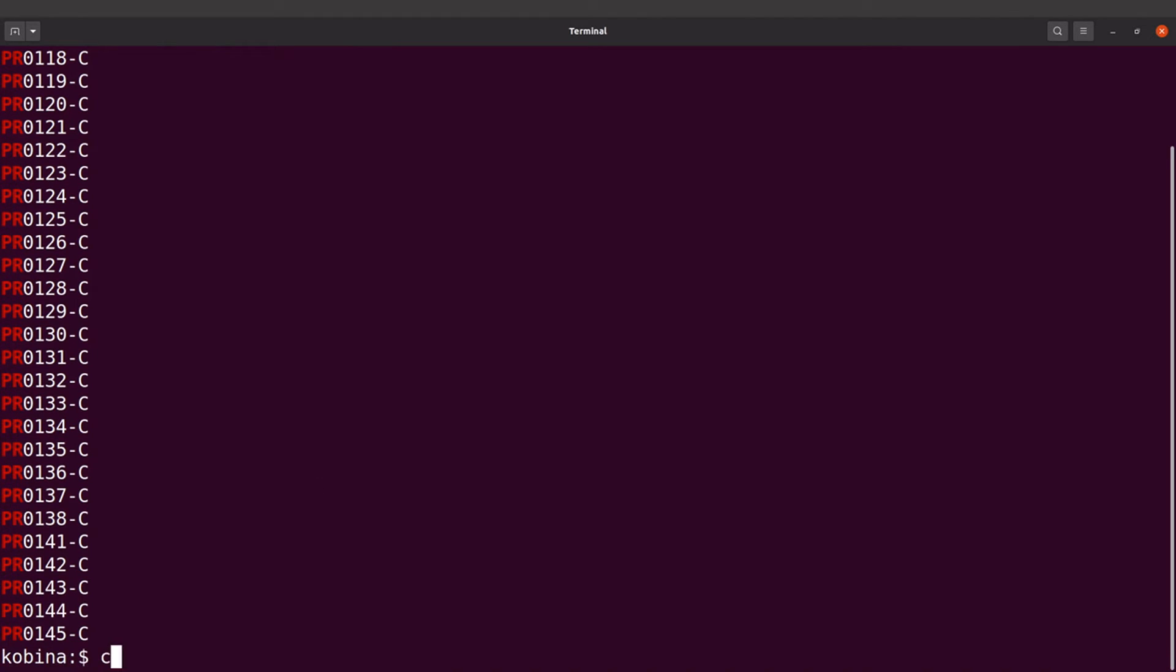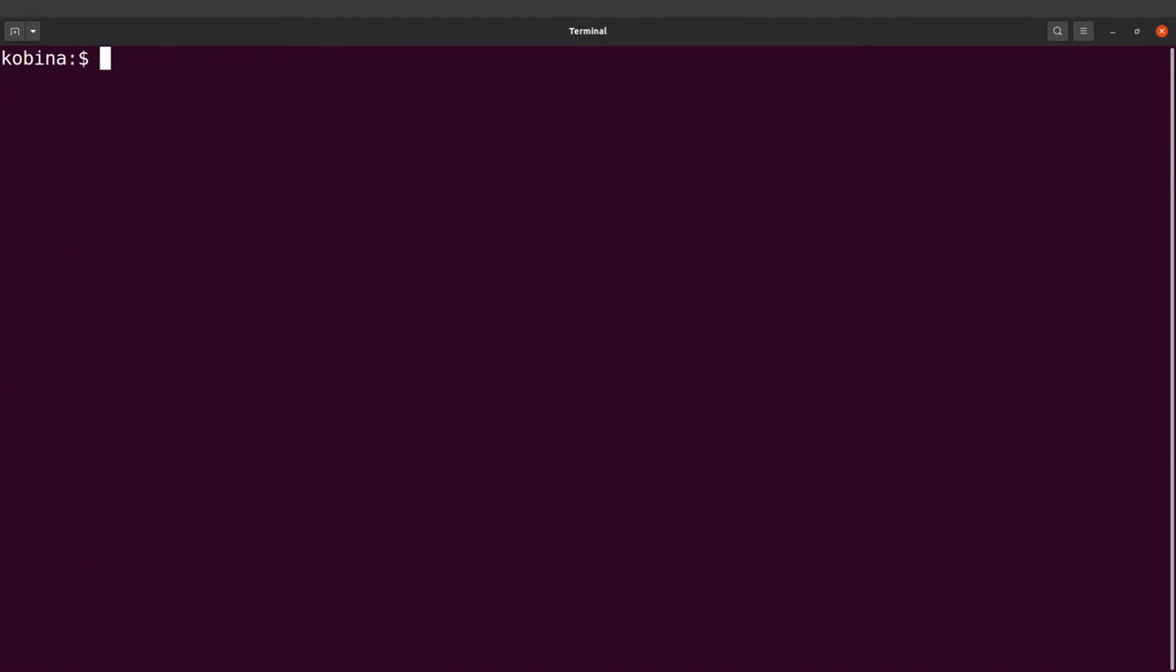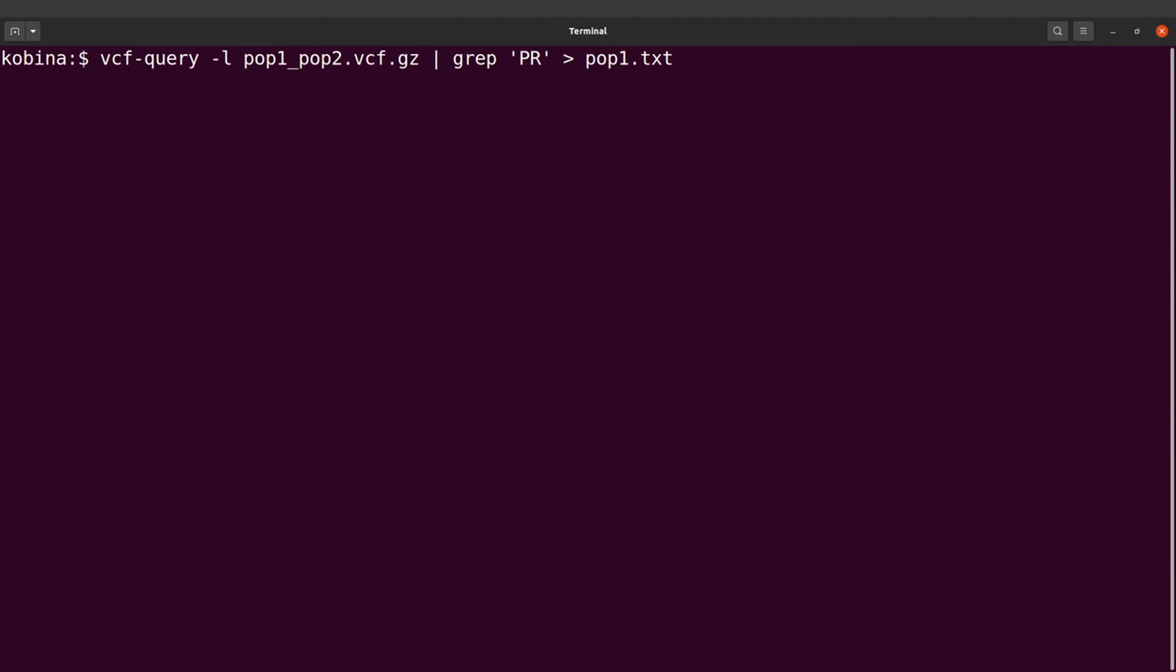So that's it, but we want to save this to an output file. So I'll also use this greater than symbol here and I'll say pop one dot txt, that's our population, that's the first one.